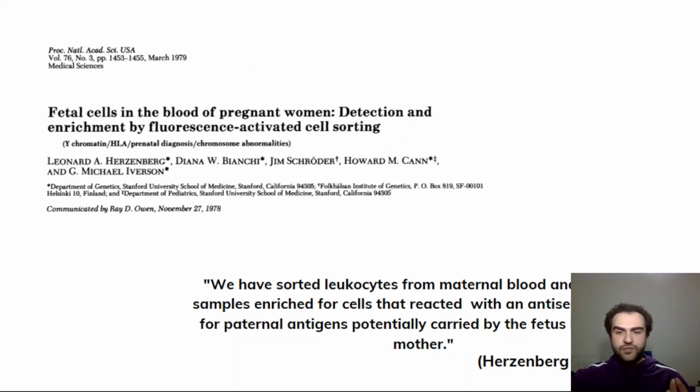The enriched samples were then scored for cells containing Y chromatin, which could be derived only from a male fetus. The use of the enrichment technique facilitates detection of rare fetal cells in the maternal blood sample. More important, however, it provides an independent immunogenetic criterion for confirming the fetal origin of these cells.